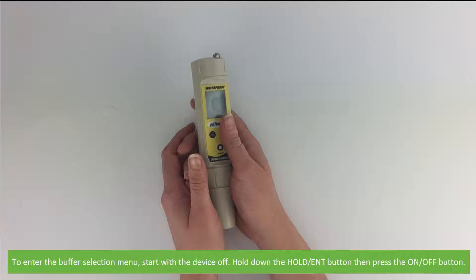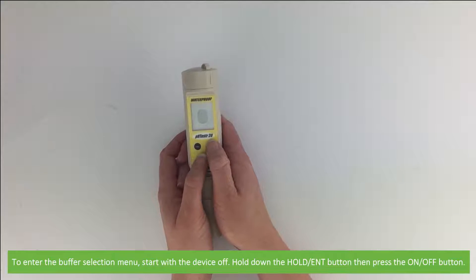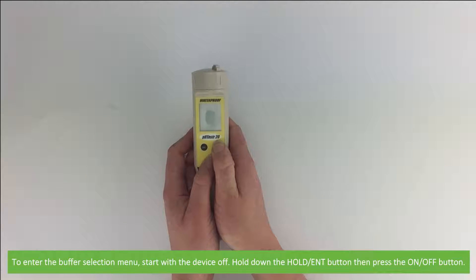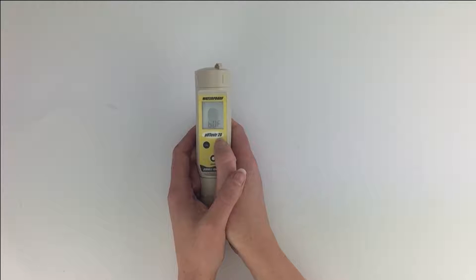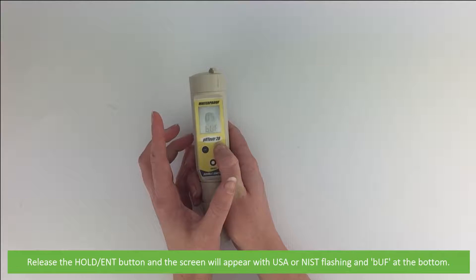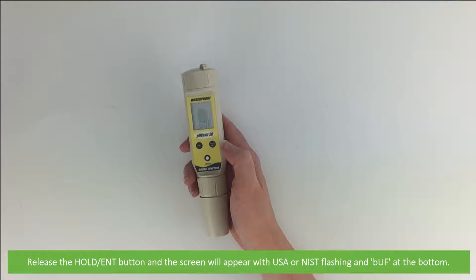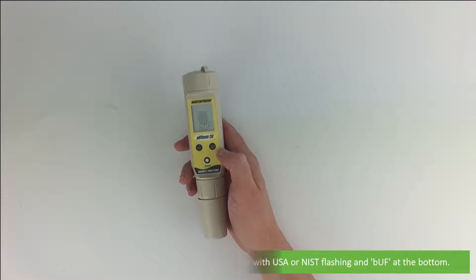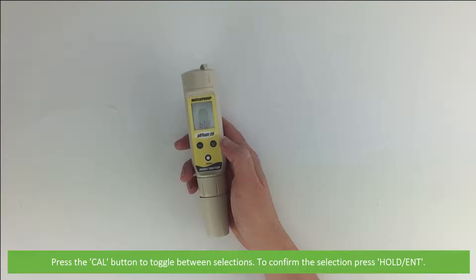To enter the buffer selection menu, start with the device off. Hold down the Hold/ENT button, then press the On/Off button quickly. Release the Hold/ENT button and the screen will appear with USA or NIST flashing and BUF at the bottom. Press the Cal button to toggle between selections. To confirm your selection, press Hold/ENT.